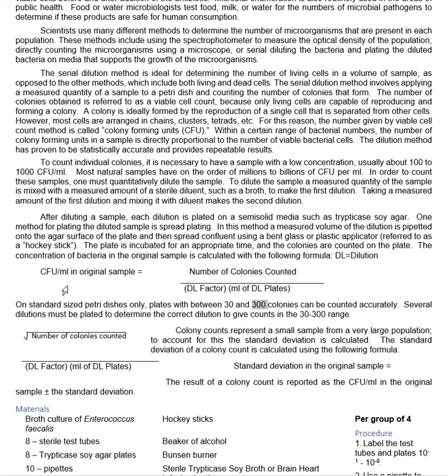Of course, some bacteria exist in chains such as Streptococcus or as pairs, Diplococcus, all kinds of things. So we more or less say the basic functional unit of a bacteria rather than an individual. And what we want to know is the colony forming units per milliliter.